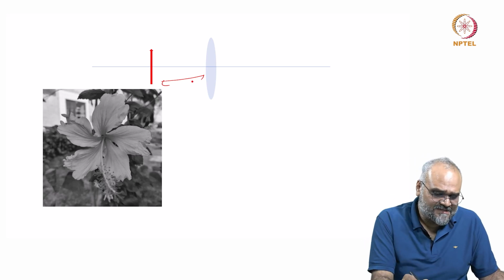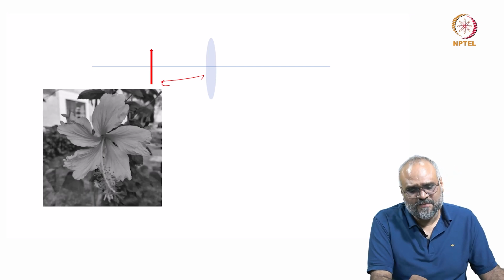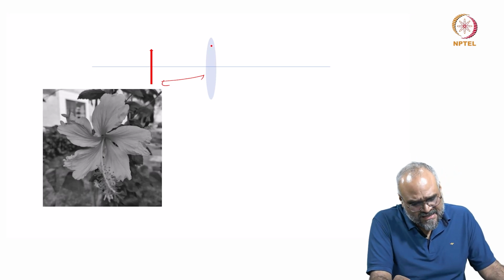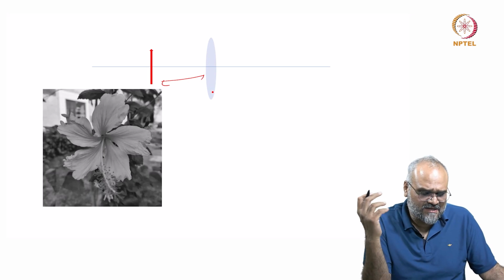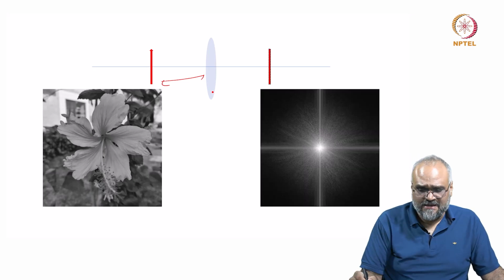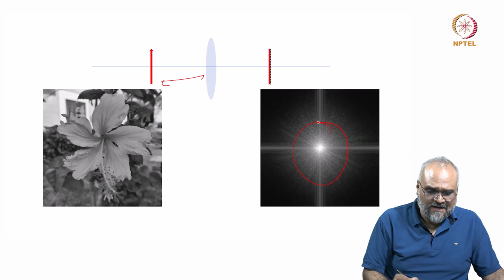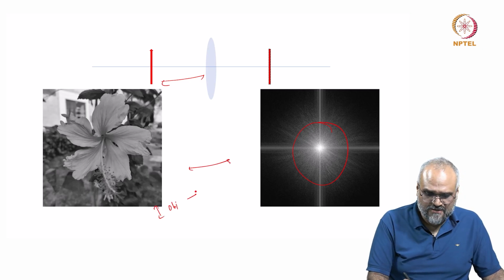The distance is extremely small, and my object here coincides more or less with the field of the electromagnetic lens used in a TEM. At the back focal plane, I have already established that the intensity in the object plane is related to the intensity in the back focal plane through a Fourier transform.